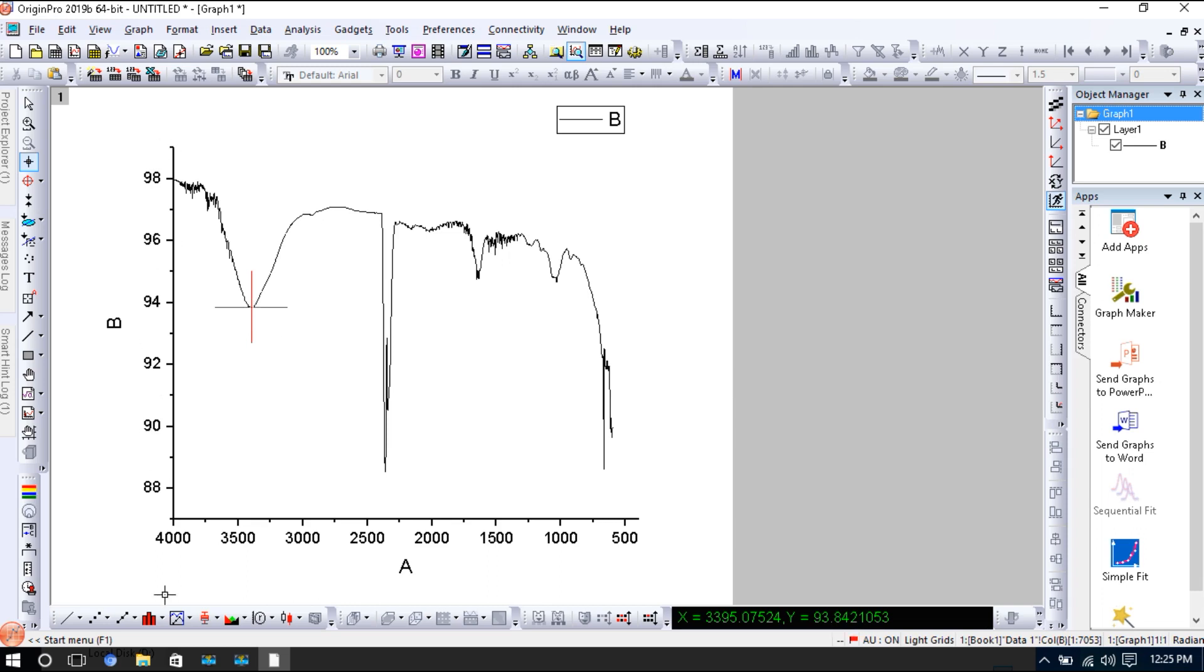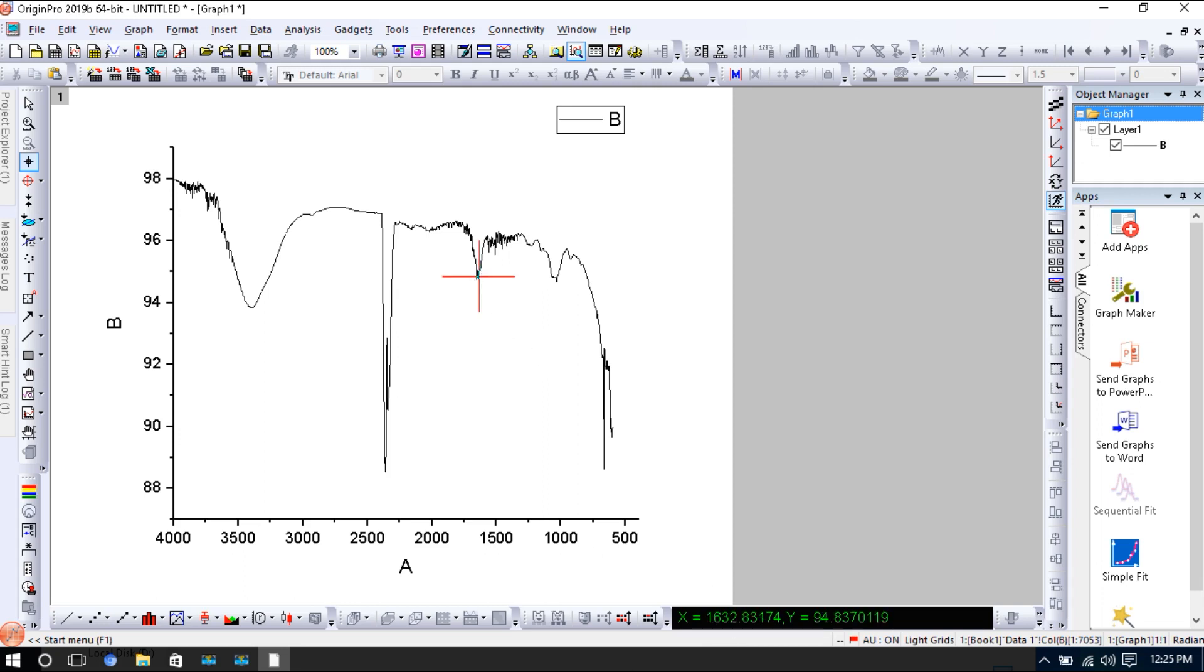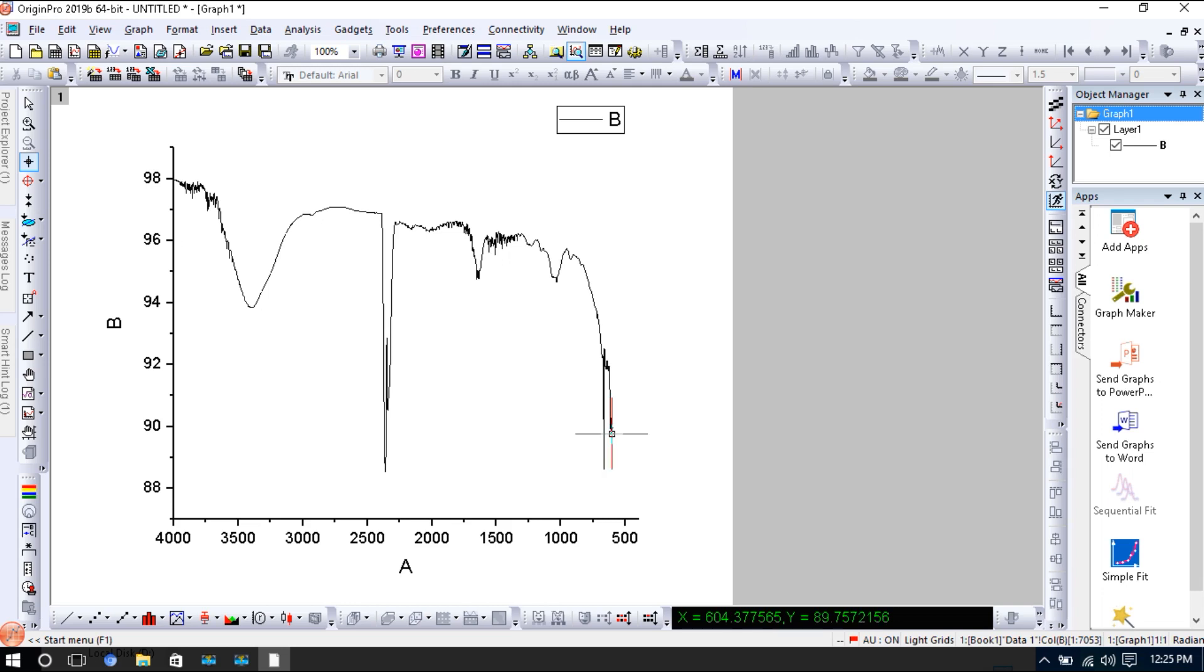The wavenumber is 3395 here, and this peak is for 2360, and this peak is for 1632. And this peak is for 1036, and this peak is 659, and this peak is 604. So now you can identify this.